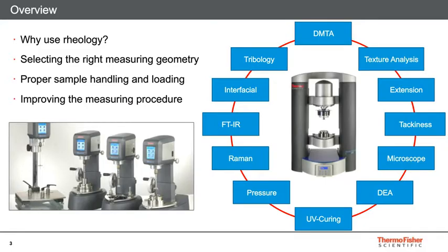So a brief overview of what we'll cover today. First, we'll go over why in the world you would want to actually use rheology in the first place. Hopefully many of you are either currently using rheology or thinking about adding rheology as part of your analytical suite in your labs, so you probably have a good idea of why, but possibly today we'll give you some added information to help fortify your interest in rheology.